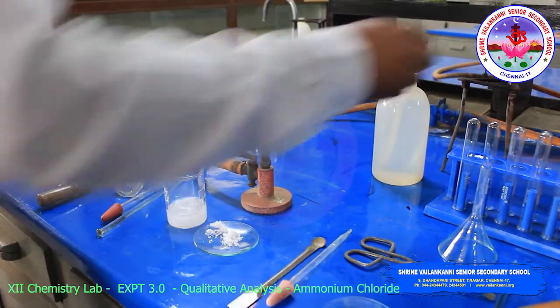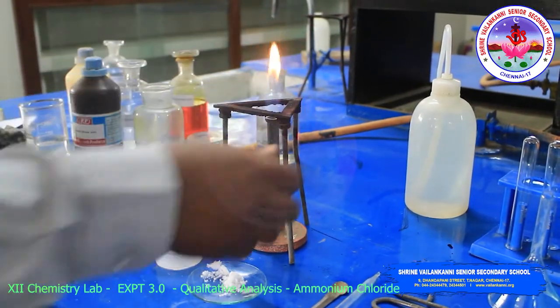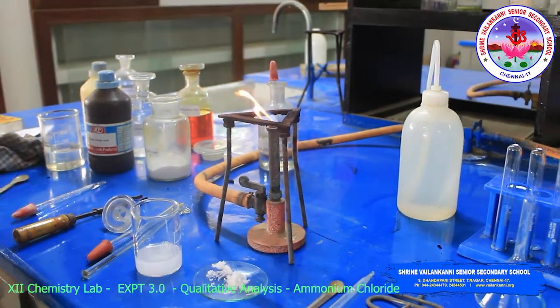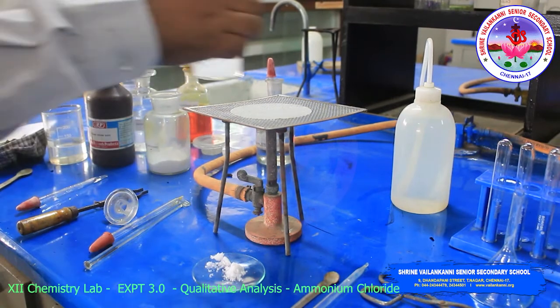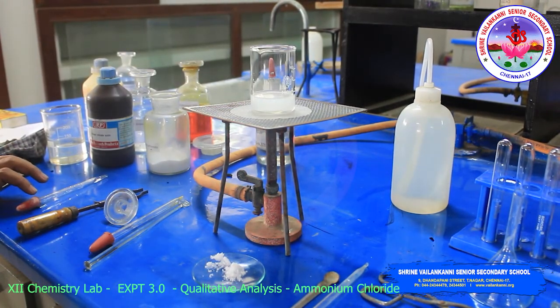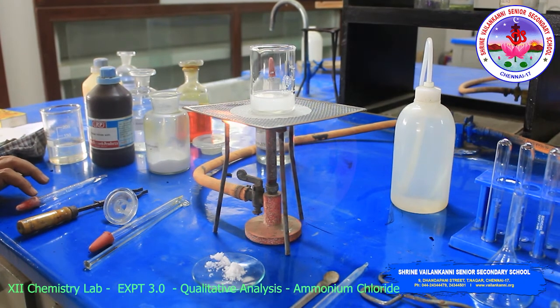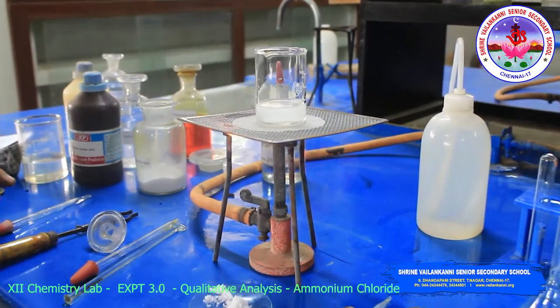Then heat the solution, just a few minutes you can heat the solution. After that, after cooling, filter the mixture. This is called sodium carbonate extract.